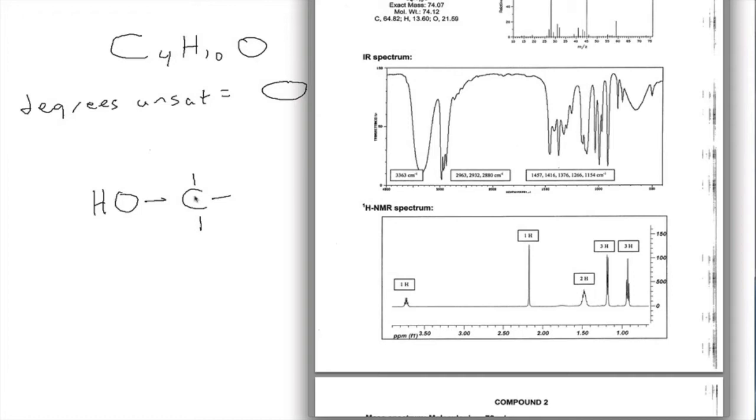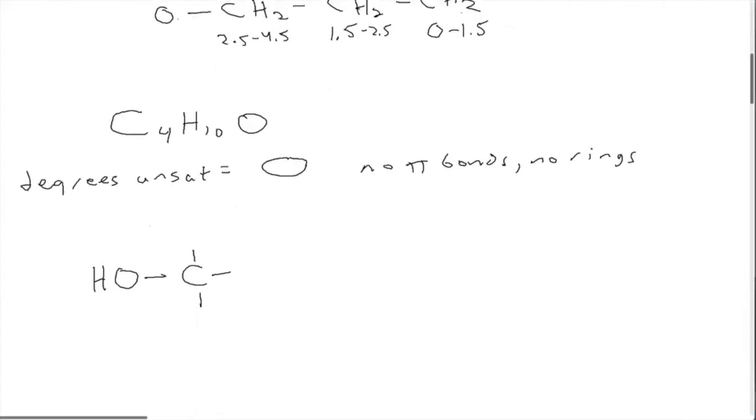So would the alcohol group have any effect on the splitting of the hydrogens near it? Well, as you said earlier, looking at this picture, alcohols are not split. And since alcohols are not split, they also don't split other groups. Splitting is a reciprocal relationship. So alcohol hydrogens don't split other things. We can see from this picture this alcohol was not split, so it should not affect the other splitting. So there should be a straightforward way to determine, if there's any hydrogens on this carbon, which of these peaks refers to those hydrogens.